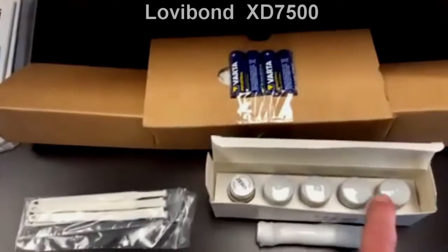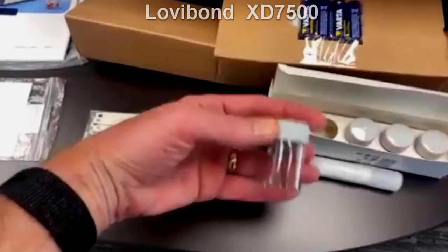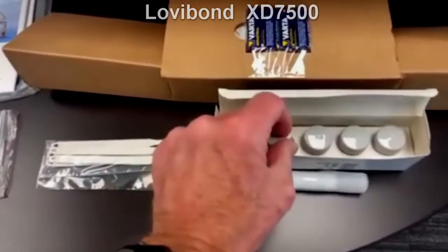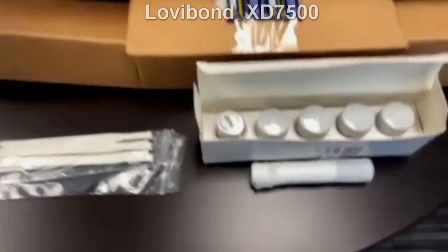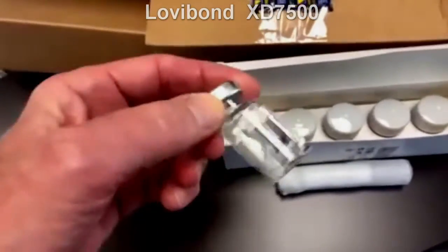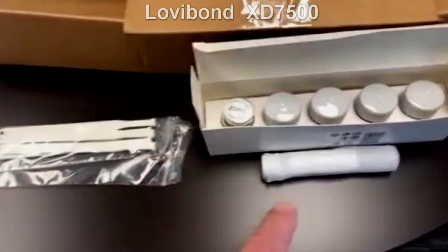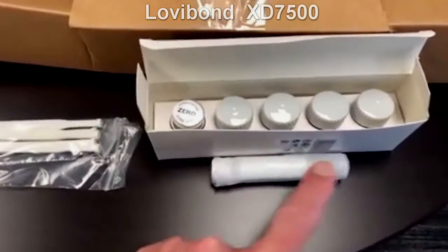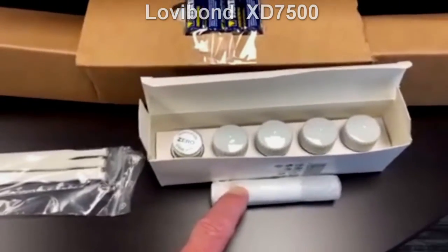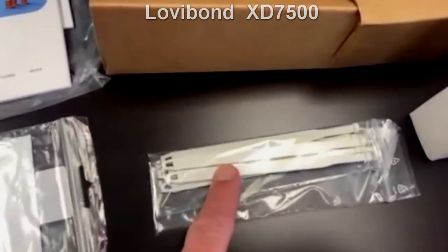You also receive four sample cells. These are the same sample cells as the MD100 or MD600 — the standard 24 millimeter that you're used to seeing in the rest of our instruments. You also get a 24 millimeter zero standard for zeroing the instrument and a 16 millimeter zero standard. This is the 16 millimeter sample cell used in all of our tube test reagents.